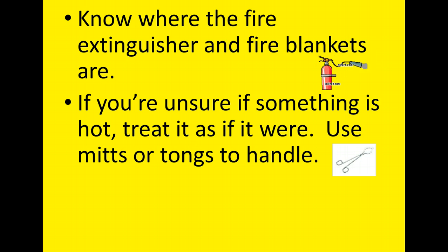Most materials don't change colors when they get heated, so if we're not sure if something is hot, then we always pretend that it is. We just assume that it is. So use tongs or use some kind of mitt or towel to pick something up with. Never use your hands.